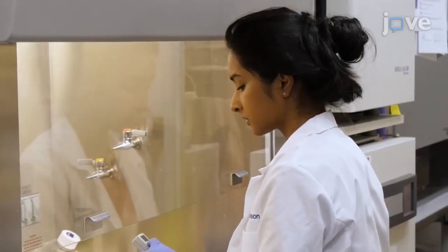Once mastered, it allows researchers to easily perform a primary screen of up to 200 compounds in 1 week, and then perform an exhaustive dose-response curve on 10 to 15 compounds in another week. Demonstrating the procedure will be myself and Rohini Manickam, a staff scientist and post-baccalaureate fellow from the laboratory.